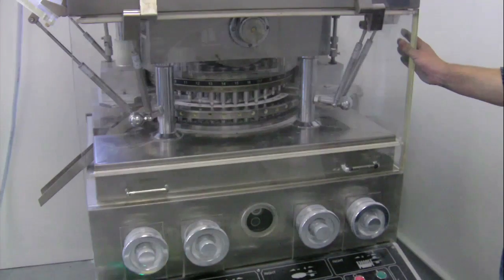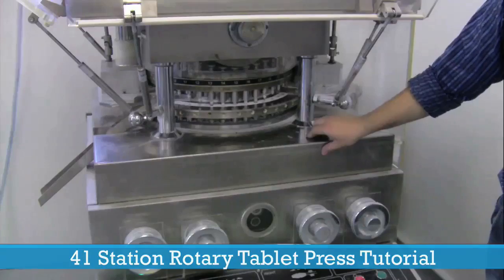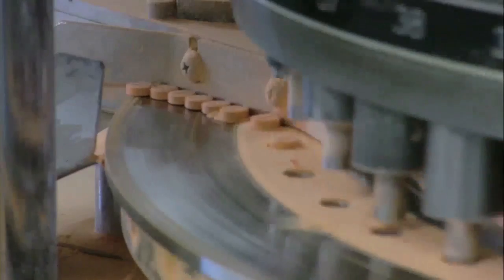Hello and welcome to the LFA introductory video to the 41 station rotary press. The RTP41 has 41 stations which allows it to make between 200 and 250,000 tablets an hour.